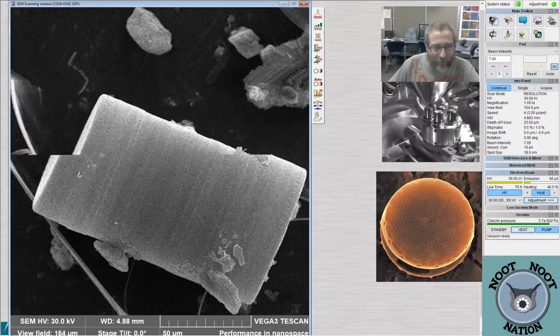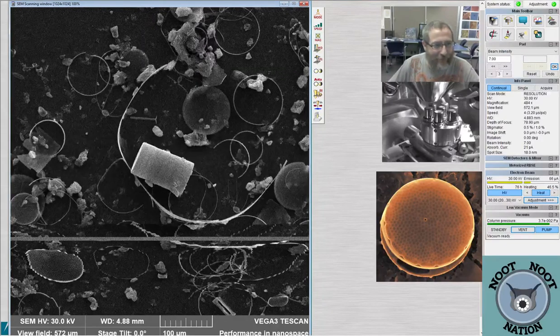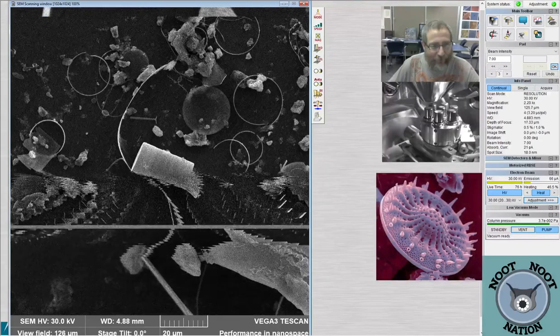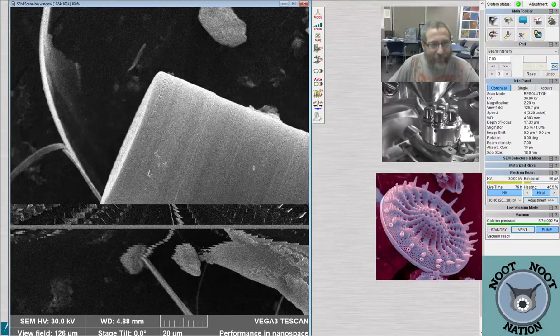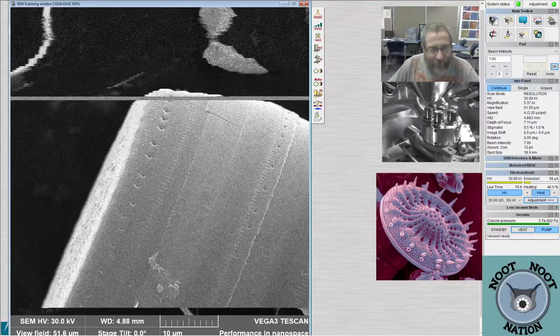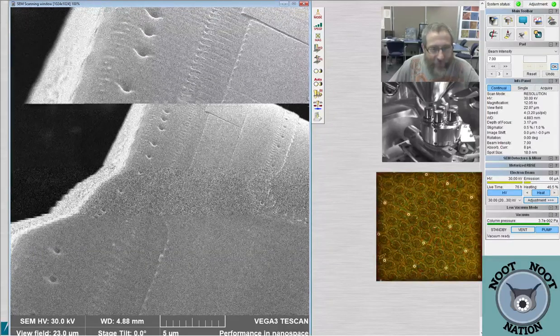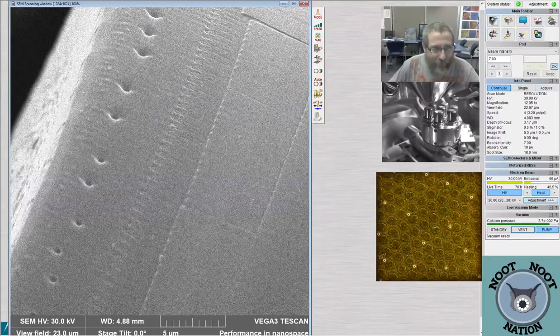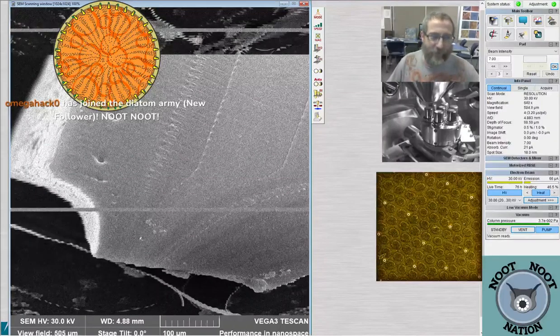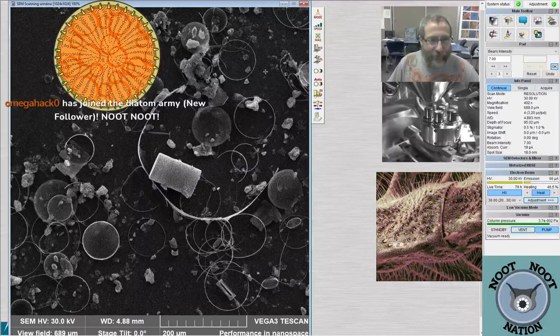I don't know what this barrel-shaped thing is. I mean, I know it's a diatom. It's got a flat surface. I don't buy that it's Ehrlichia... Ehlerbeckia. Why not? Oh, wait. Maybe it is. Yeah, I think you're right. The other picture you took of Ehlerbeckia. I think it's Ehlerbeckia, because there's poker chips, right? Poker chip margin. Okay, I will accept Ehlerbeckia as an answer then.